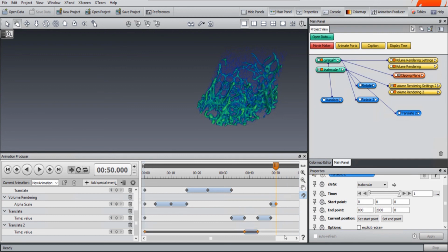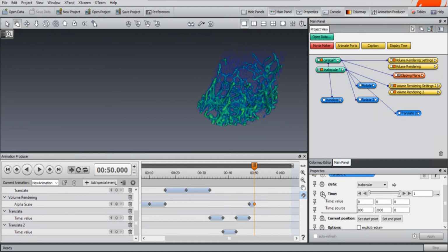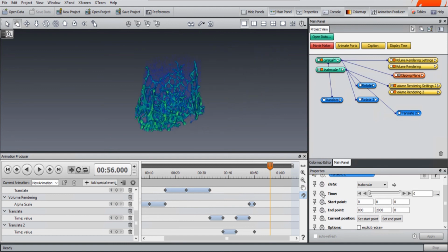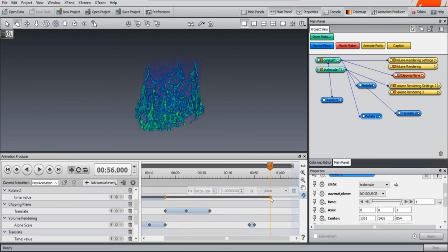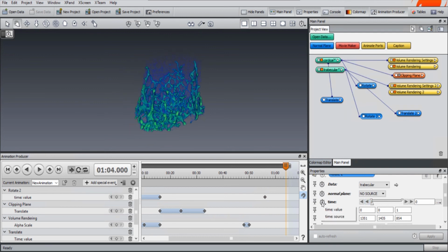Let's make this one larger. And now we go to the same position. There is nothing happening in between. And now I will move this one back to the middle like this and add the time frame. And I can of course rotate this one again. I don't need to worry about the cortical because the cortical is already there. So it created another point here in the same line as the rotate, and I can rotate backwards now. Until here. And that's it. I can finish 1 second later or 2 seconds later, so that I just have the image stopped there.